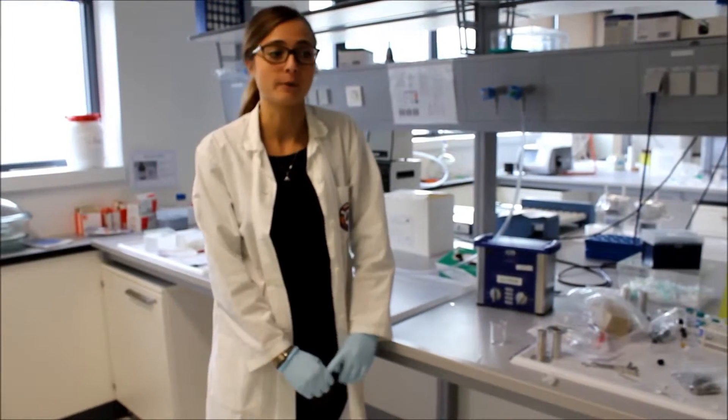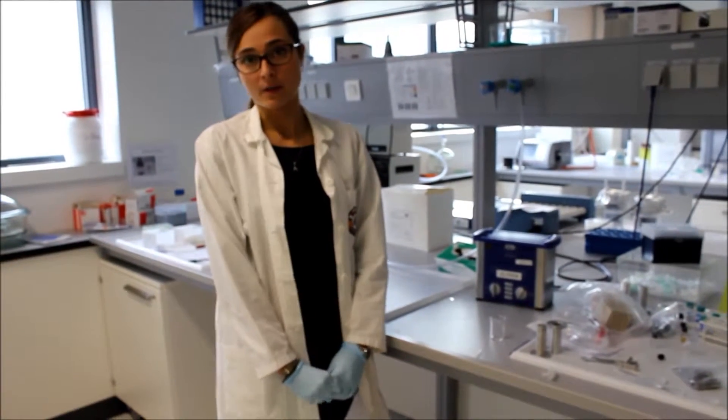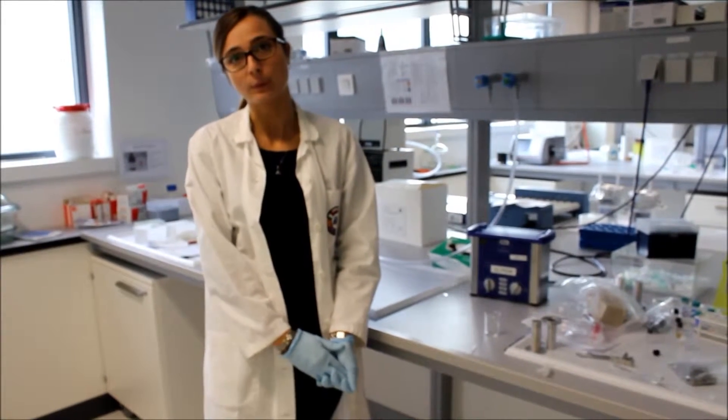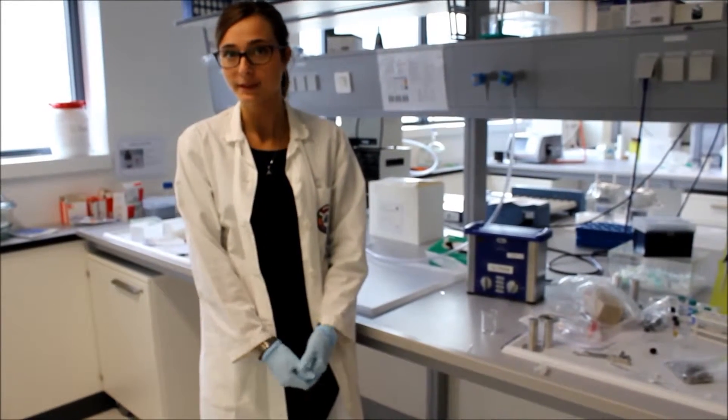I'm here to perform an experiment on a reflectometer instrument and I'm using PSCM lab to prepare my samples, which are composed by vesicle suspension.